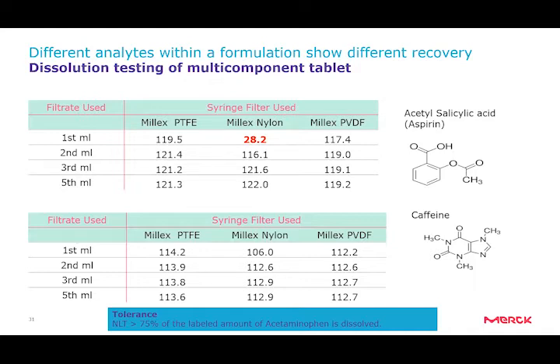Both the PTFE and the PVDF membranes do not contain various functional groups, or very little functional groups. And because of that, they generally tend to show very low analyte binding, even for the first ml of filtrate.